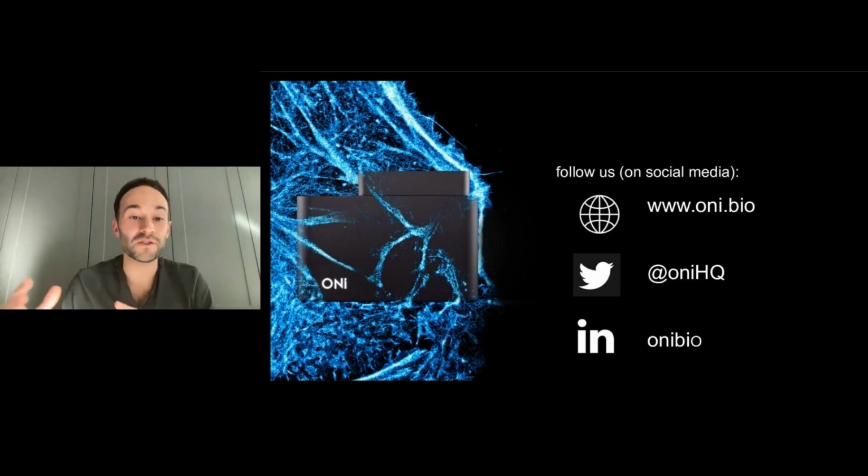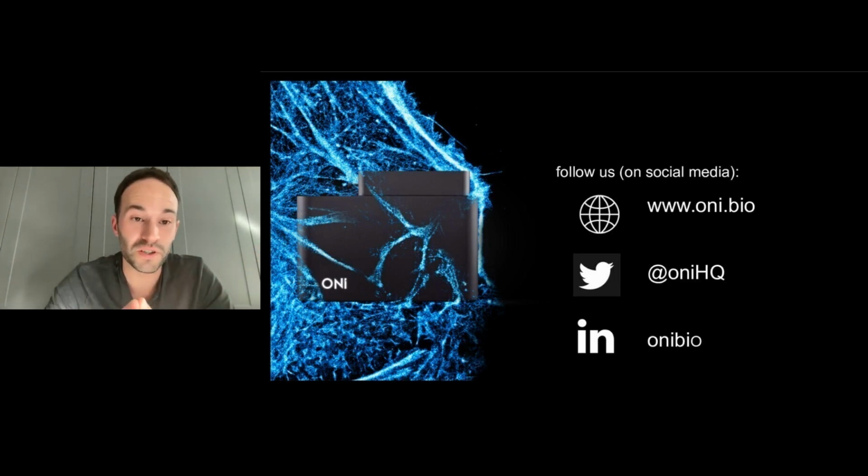The other thing it means is you add an awful lot of molecules to your EV, and there are several studies out there that show when you use lipid dyes, you actually just increase the size of your EV because you put so much additional material into the EV. So it is possible, but it's not straightforward. And generally, we try and avoid that, and we use more methods that do not directly impact the membrane.